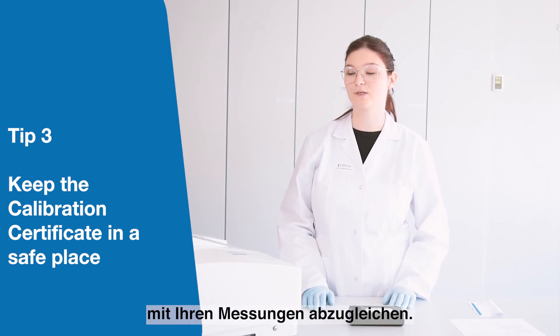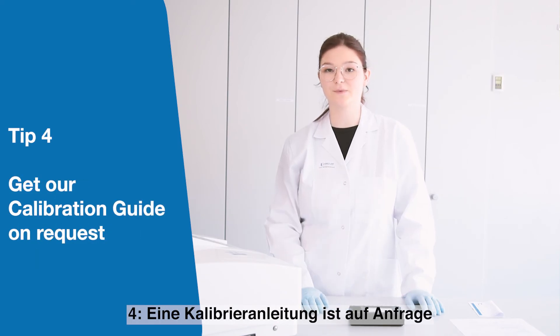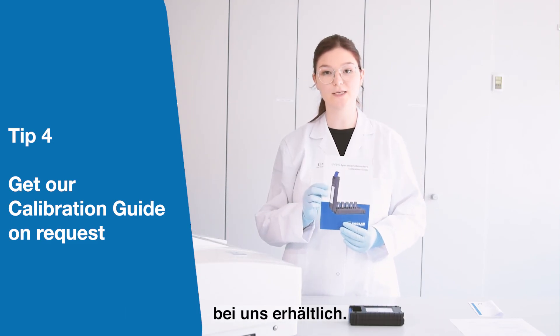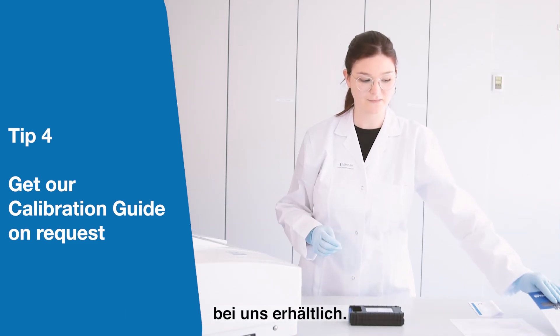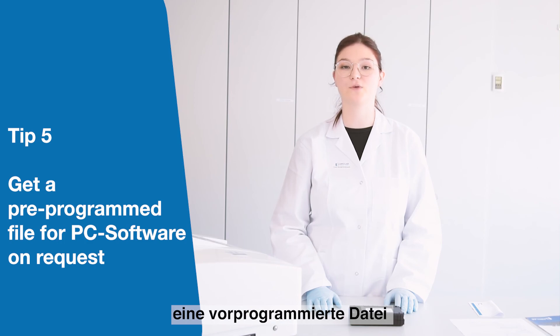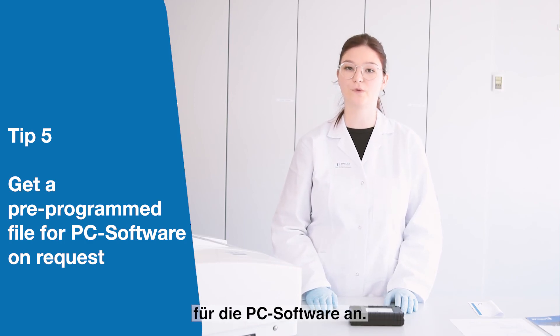The fourth tip is that you can get a calibration guide on request. And last but not least, we offer a pre-programmed file for the wavelength and photometric accuracy for all our PC softwares on request.